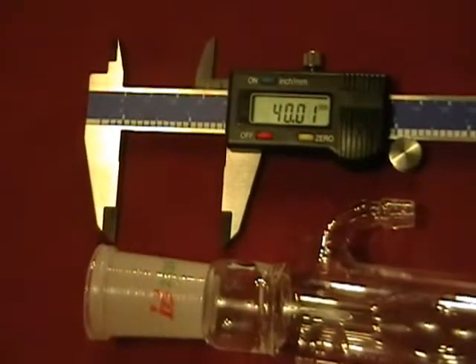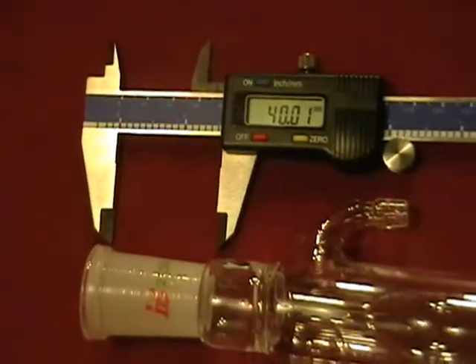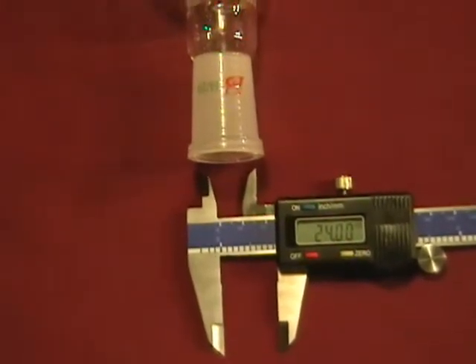These are mislabeled as 24/29. I used this digital caliper to show you it is just a misprint and it is indeed a 24/40 ground glass joint.